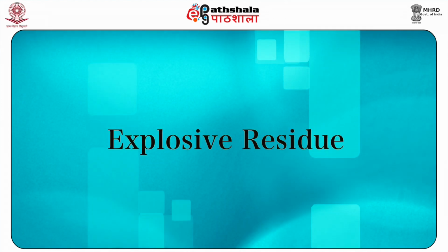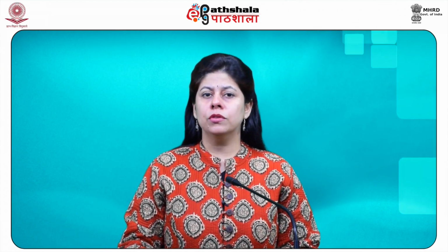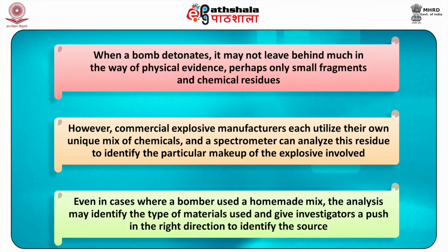Explosive residue. Another area where spectrographic analysis is extremely useful is analyzing explosive residues. When a bomb detonates, it may not leave behind much in the way of physical evidence, perhaps only small fragments and chemical residues.